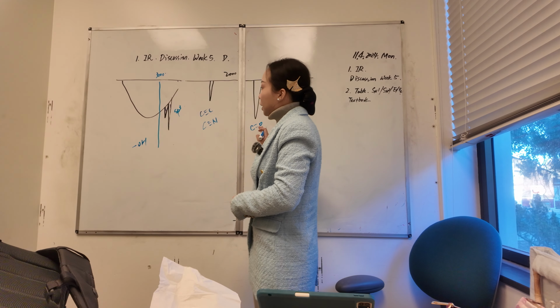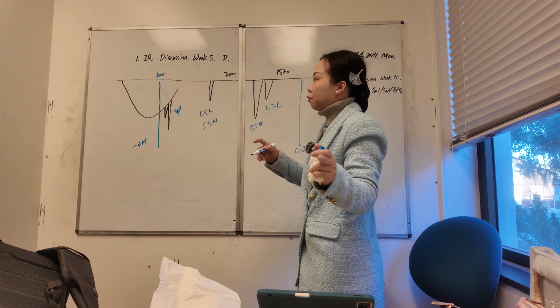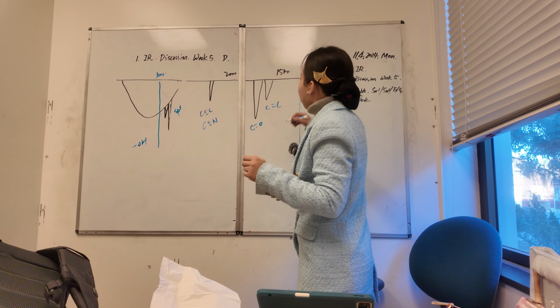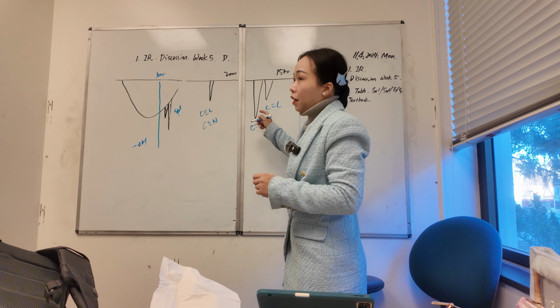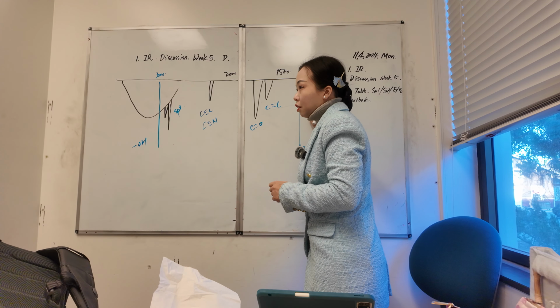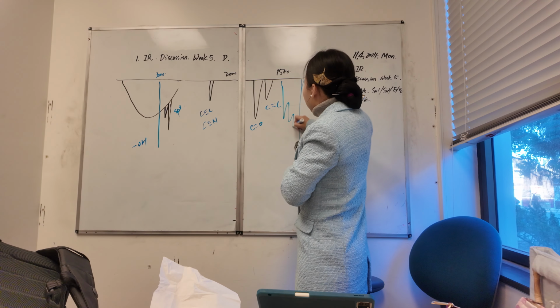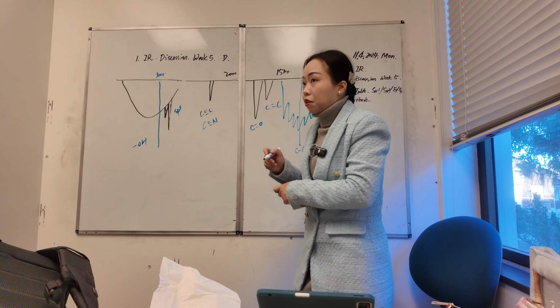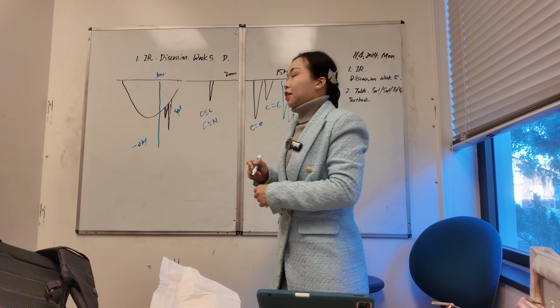But if you do see a really sharp peak, like the Gaussian peaks we draw just to let you know there is a peak. In reality, it's really hard to see if it's a peak or noise, because fingerprints will be just something like this. How do I know that's a peak or not?